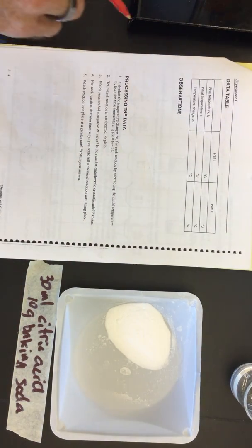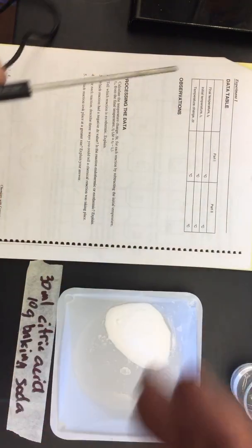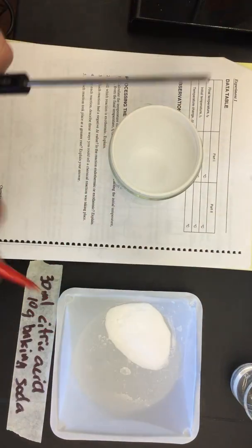What I need to do is get the temperature probe ready, and so it's right here. And I also have this little setup here. It's styrofoam. Styrofoam is to help retain the heat or prevent heat loss. And so it's just sitting inside the beaker to provide some stability.